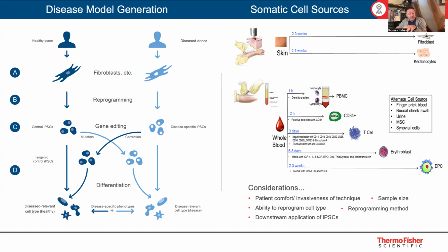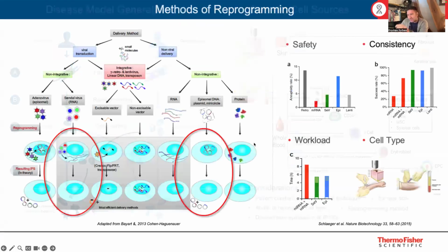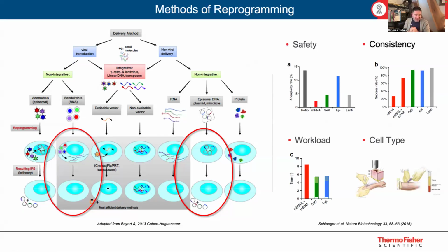Nowadays, even honing in on the contributions of, say, a single gene with respect to a particular disease. And again, we're going to do this at the end of today's talk in the context of a heart disorder called dilated cardiomyopathy. And so once we have all those cells for in vitro modeling, the next step in our workflow is reprogramming, which again, Omar covered in the second lecture.